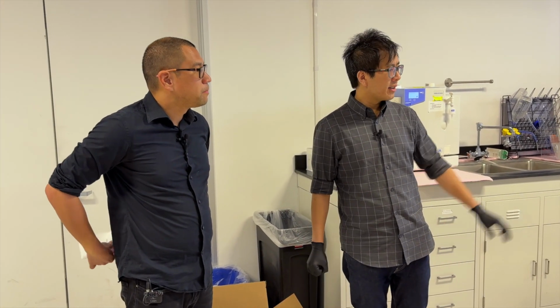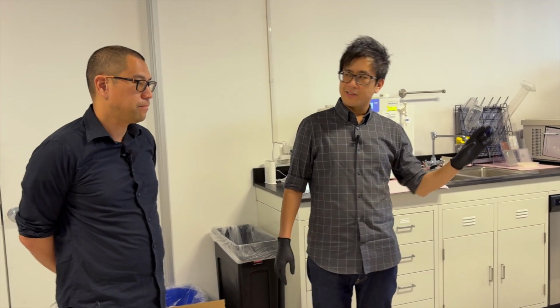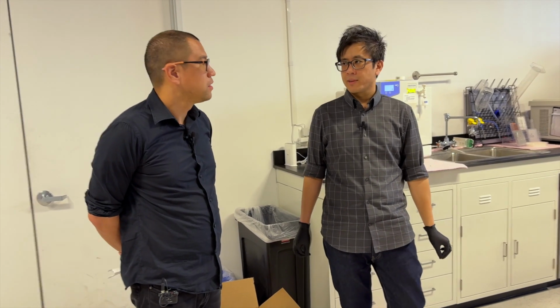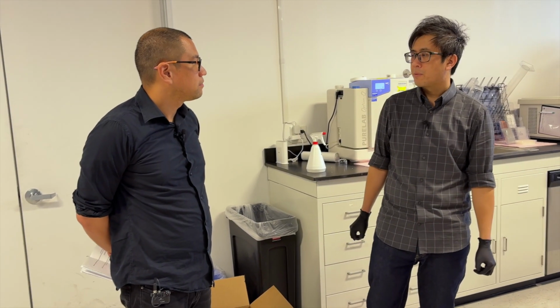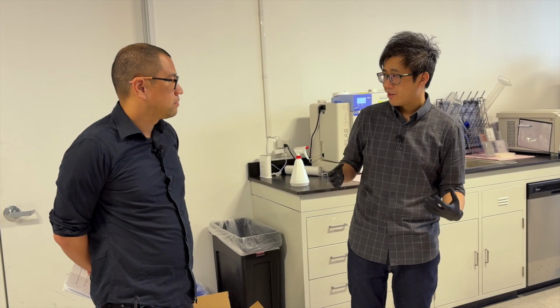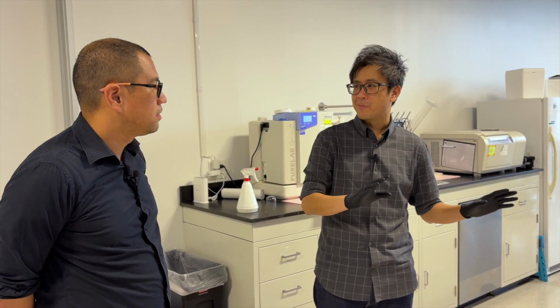So you'll see as we start walking through the lab, there's some areas that are pretty automated, some areas that are semi-automated, and some areas that are pretty classic, really just bench work areas. And I think it's pretty important to lay it out that way because when you're doing R&D discovery, everything changes all of the time, and you can't really make a fully automated system for everything. So every place has to have its home, right?